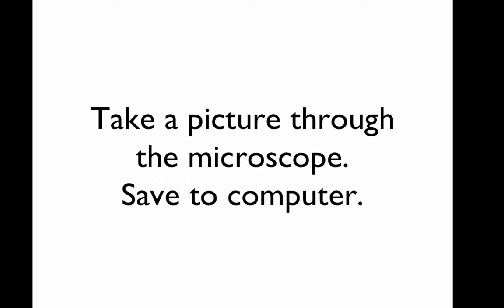This is amazing and fast. Warn students to be ready. They will see the plasmolysis of the cell membrane in real time. When the changes stop, take a picture of the cell through the microscope. You can use your cell phone with a steady hand or a point-and-shoot camera where the lens snugs down into the eyepiece. It's a good idea to have a few backup photos preloaded for the class to access.